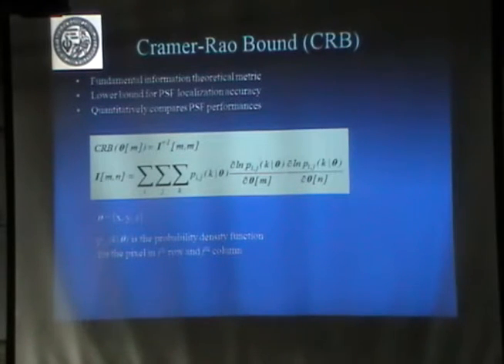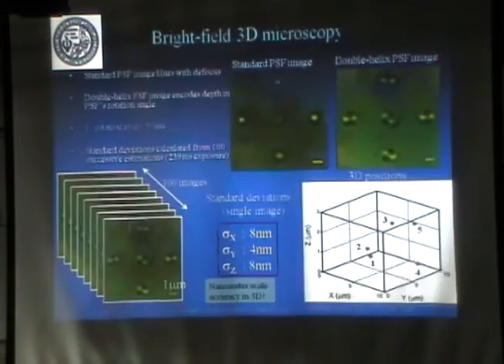If you have white Gaussian noise or Poisson noise statistics, then you can show that the probabilities are eliminated. Essentially, it takes into account the different options for noise. So going back, what you're trying to do is measure how fast things change with the parameter you're measuring, and that's the Cramér-Rao bound.